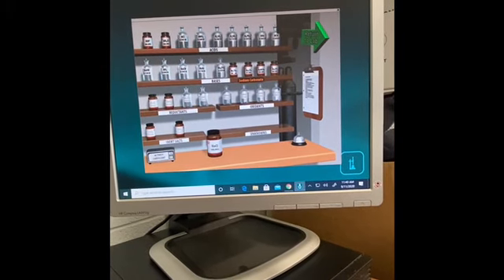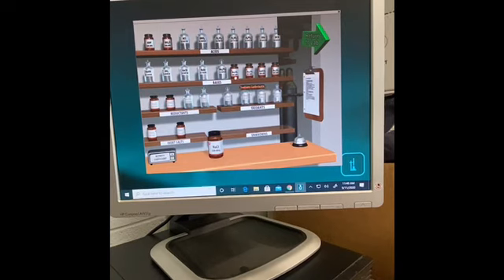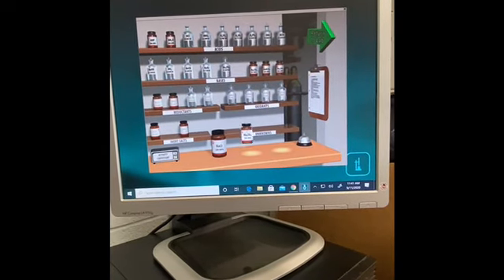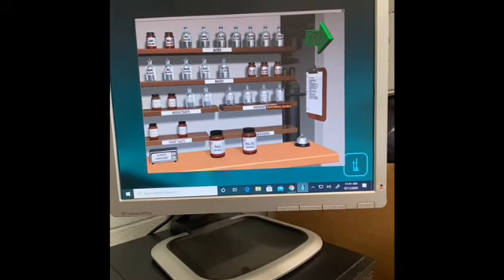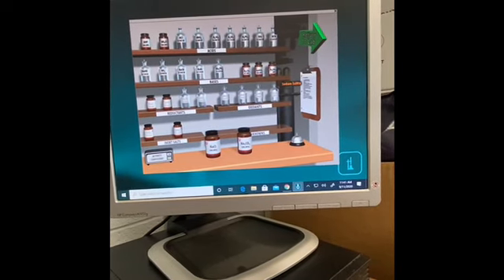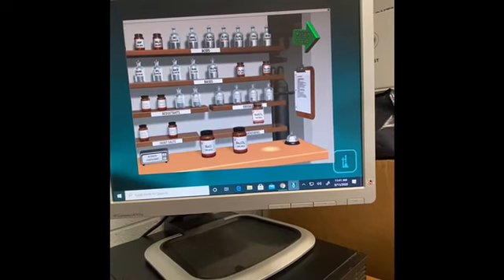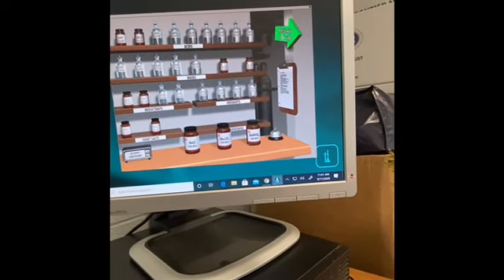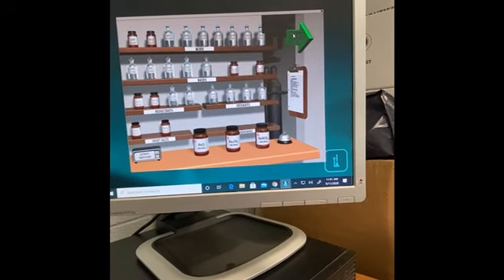Then we need Na2CO3 100%. That's up here in the middle. Click in there and drag that one down. And then NaHCO3 100%. Okay. And now return to lab. So we go up to the big green arrow, it highlights, and we click back to lab.